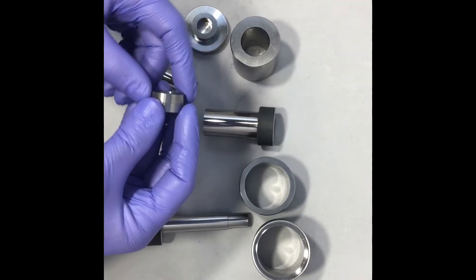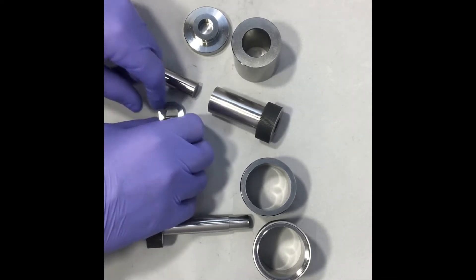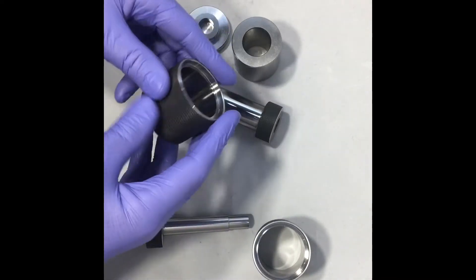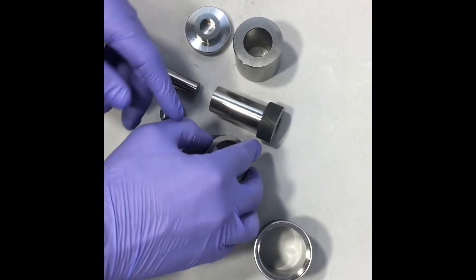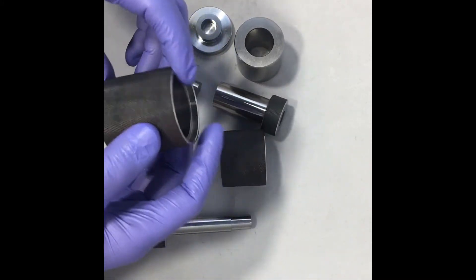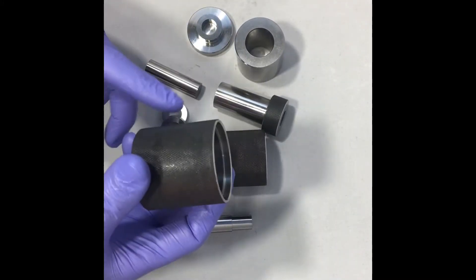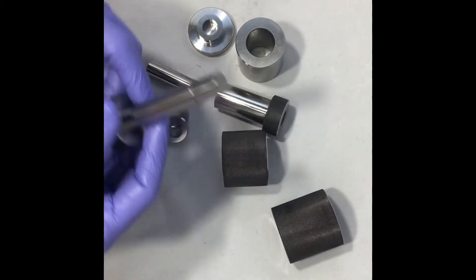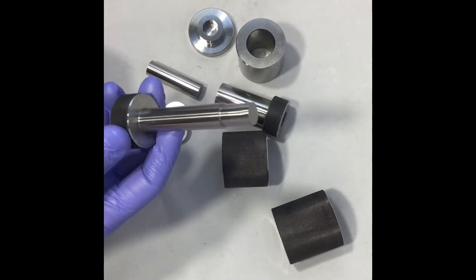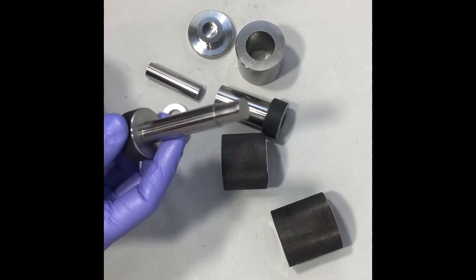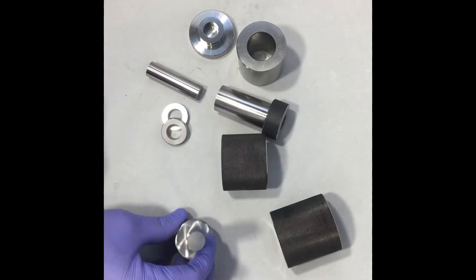We've got our two spacers which you can use, you don't have to use them. Then there's a normal ejector sleeve and with our sets we include an extra length ejector sleeve and a pin ejector just in case your pin is stuck after compacting your pellet. You can use this for getting it out.